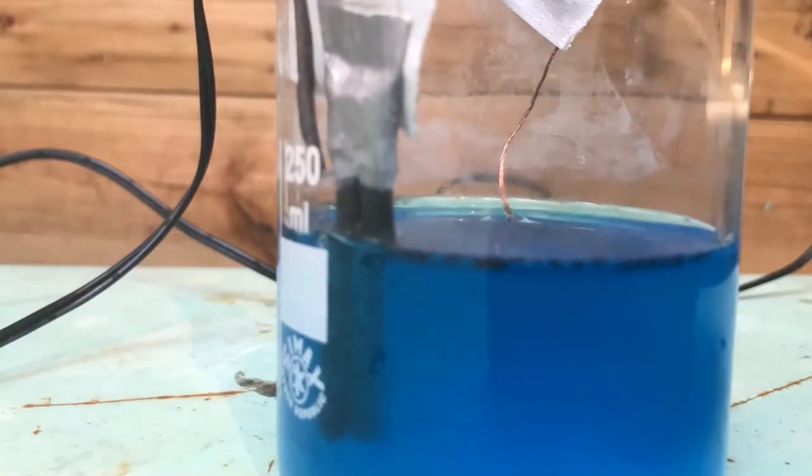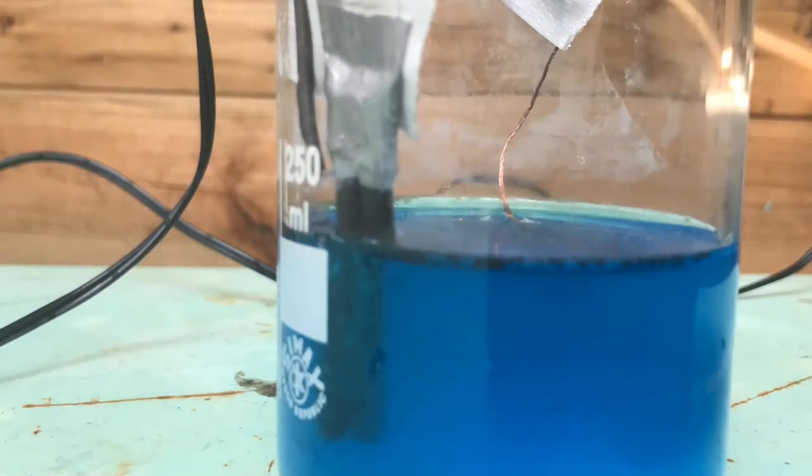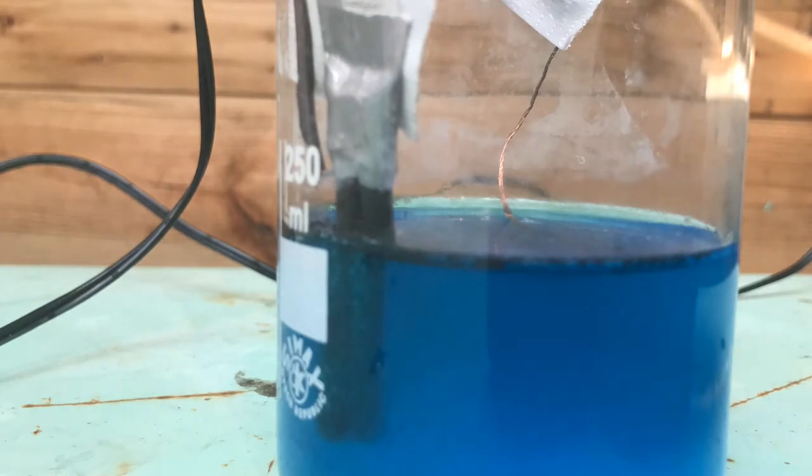Now if we let the current flow through the solution, you can see bubbling at the anode. You just need to let it run until there's no more blue color left. This can take anywhere from a few hours up to a few days — it all depends on your source of current. In my case, it took only one and a half days until there was little to no blue color left.